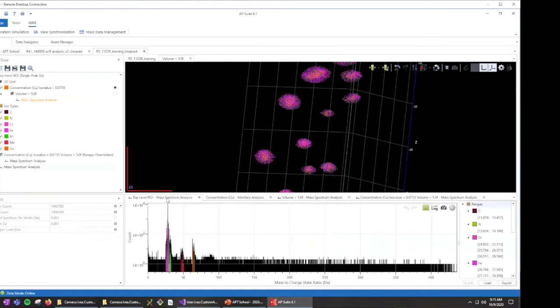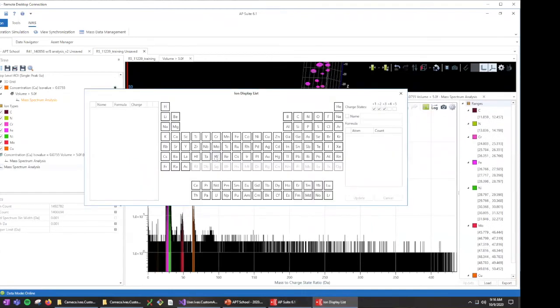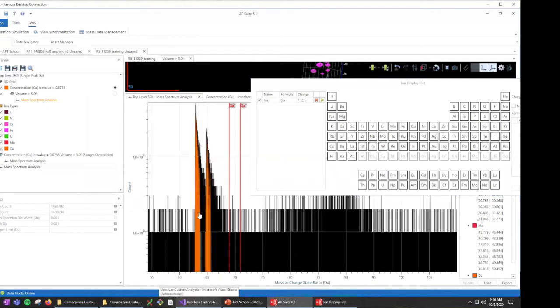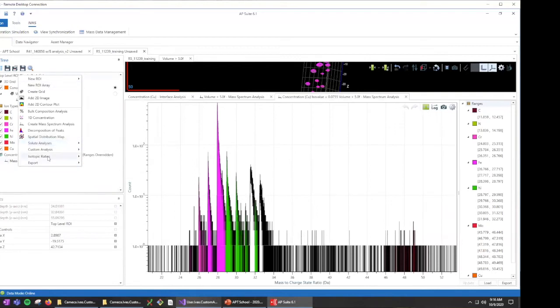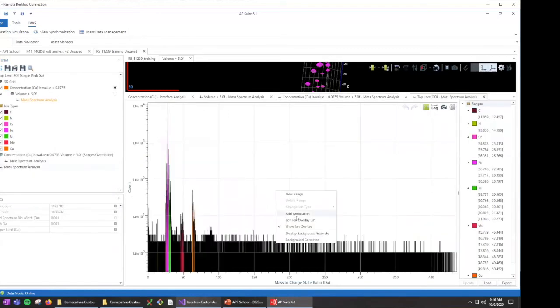Now when I go to my mass spectrum here, I'm going to open this up a bit so you have a better look. And I show my overlay of gallium. Should have one peak, maybe I have to change it here. I have not tried this, clearly. Let's just re-add it quick. So isotopic ratios here, mass spectrum, show the peak overlay.